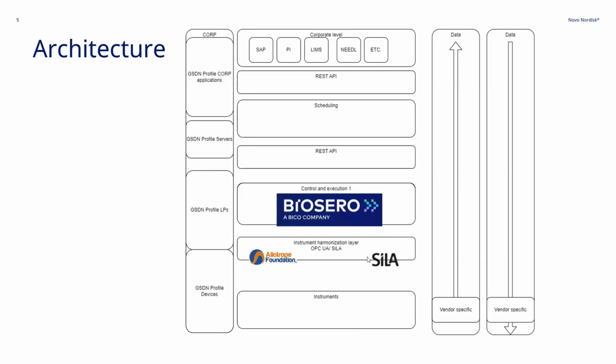And here is where, with the help of the framework of SiLA 2, we wrap the functionality for control of all the instruments, and then we wrap that the response of each of the instruments follows the information of the data of the ASMs. And then this is where the project has the highest focus.